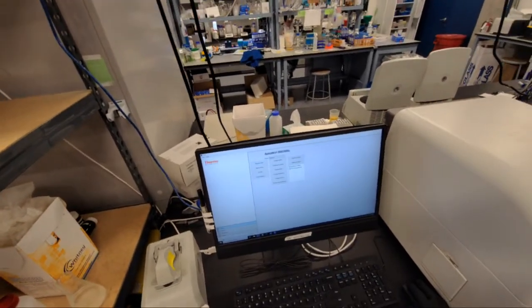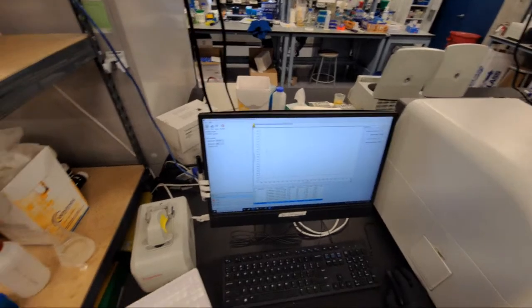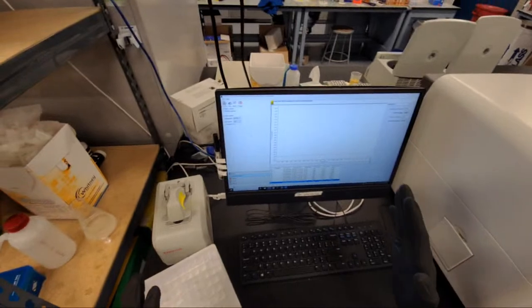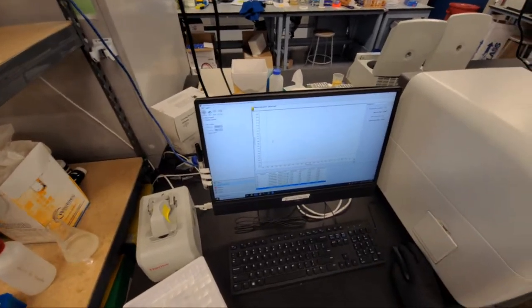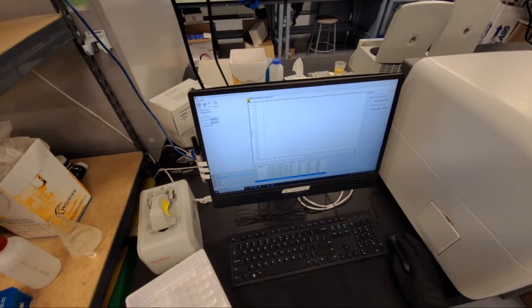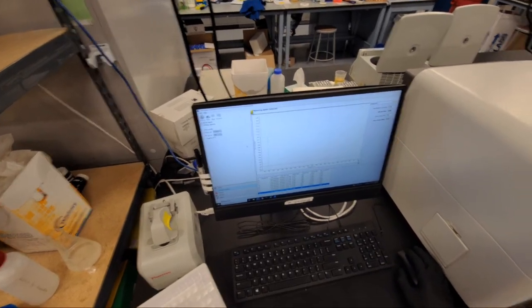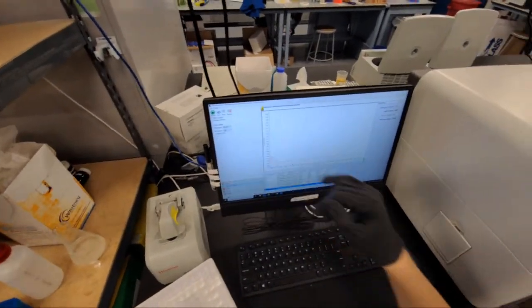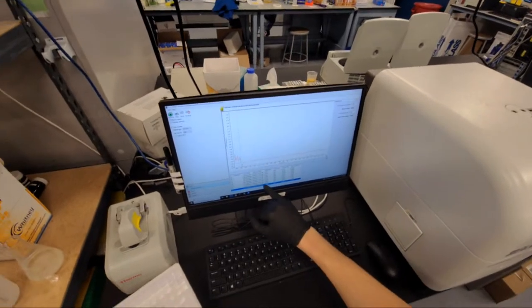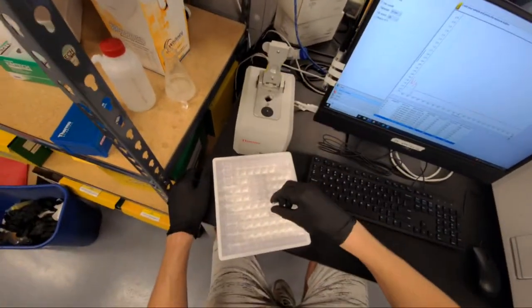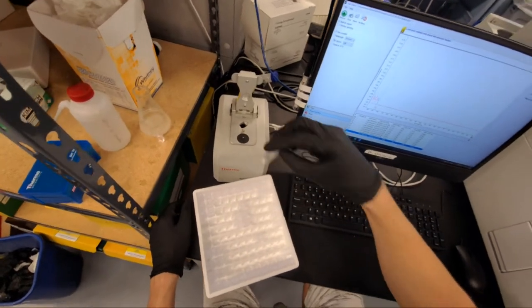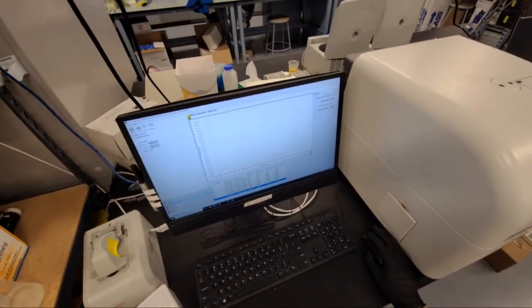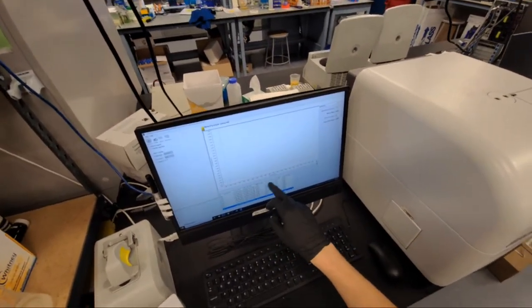And in software, you may or may not be able to see it. But we need to go to measure cell cultures because that's what we're doing. I'm going to blank it and then measure it. So we do need to make sure the use cuvette radio button is checked. And we get a measurement of 0.001 when we measure the blank, which is perfect. We want to be within, for our samples, we want to be within 0.1 and about 1.2 absorbance at 600 nanometers.